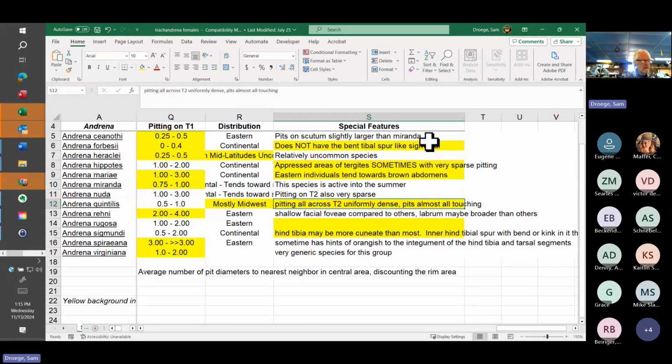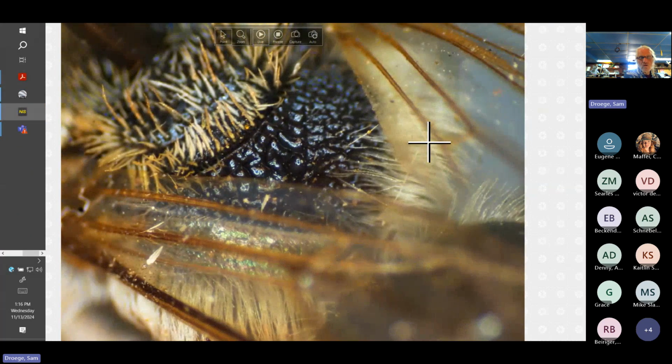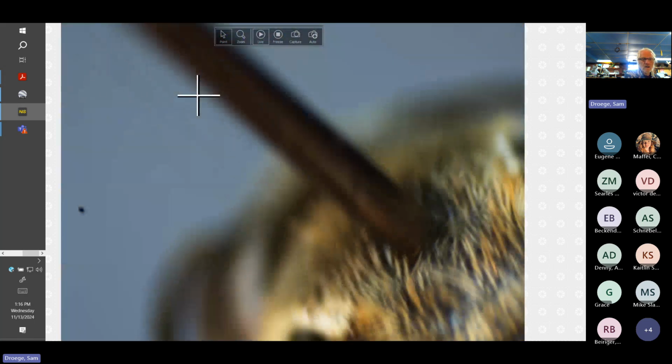Okay, so we're looking on the thorax. Well, first of all, let's go back here. Let's take a quick look again, just to get a visual. So you just see in the propodeal triangle area, which is this boundary here, you can see the difference. But this internal area is a little bit of a crazy mix of elevated striations, making cells, but a lot of times they're curved or have involutions into them. So it's not a set of rectangles. Here, I think, is what is being mentioned already.